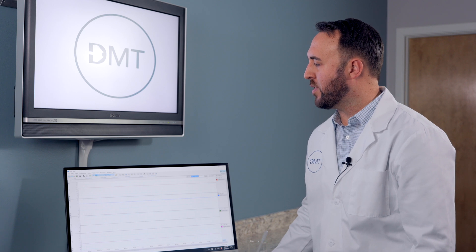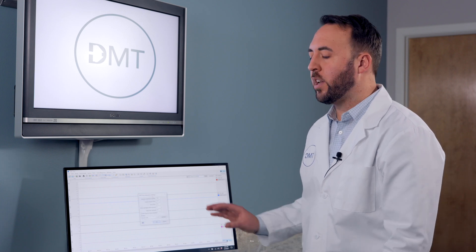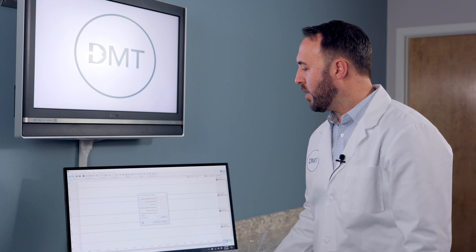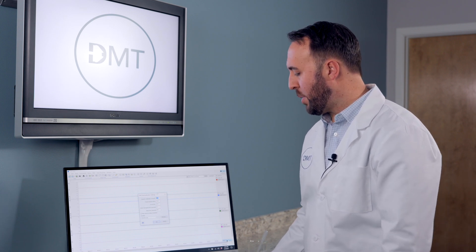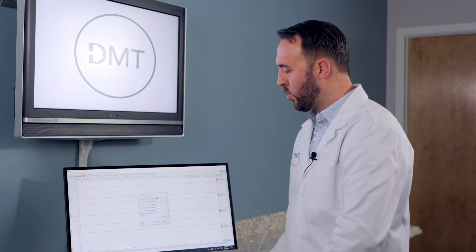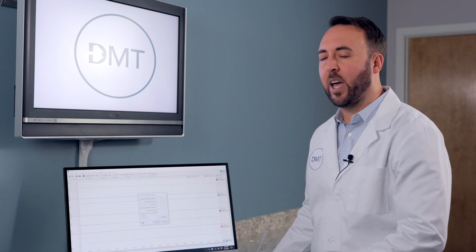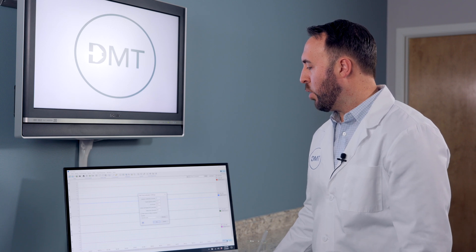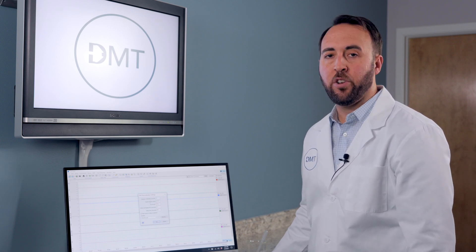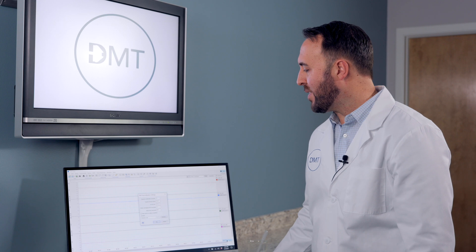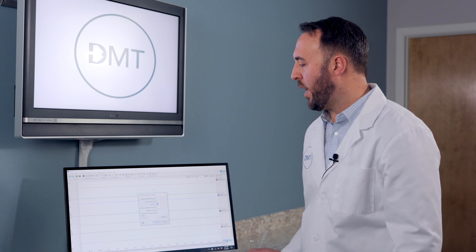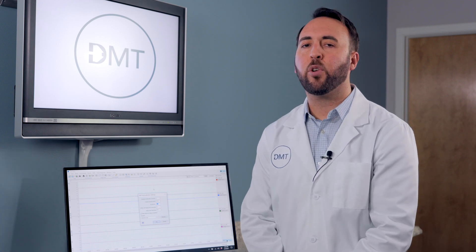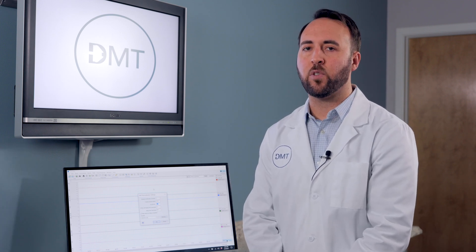So we click on DMT and Settings. Now, these settings will be dependent on the type of vessel you are using. The first is eyepiece calibration, and we're going to use one so that we can type in the length of our vessel. Your target pressure will be dependent on your vessel type. And this IC1 to IC100 value is dependent on your vessel type, and this must be done earlier to characterize the type of vessel you are using.